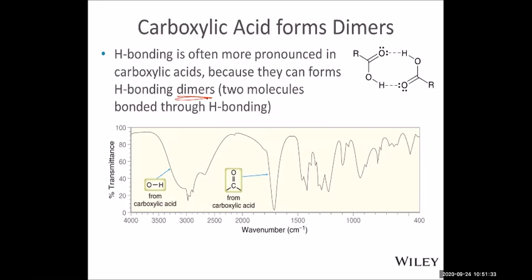And this should be fairly significant. So we're done with around 3,000 wave number. We move down to below 3,000. Below 3,000, the carbonyl. Carbonyl should be around 1700. But notice this carbonyl has a carbon-carbon double bond linked to it. This we call a conjugated ketone, actually a conjugated carboxylic acid. And the double bond will bring down the frequency.